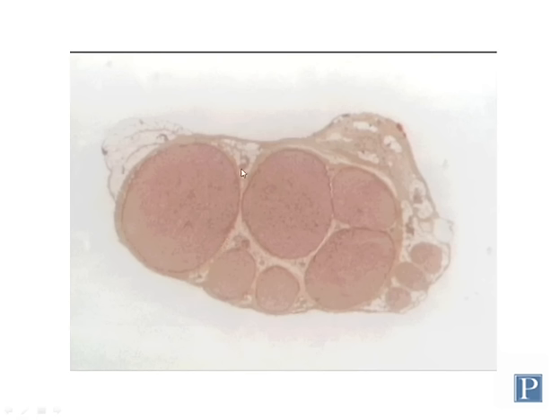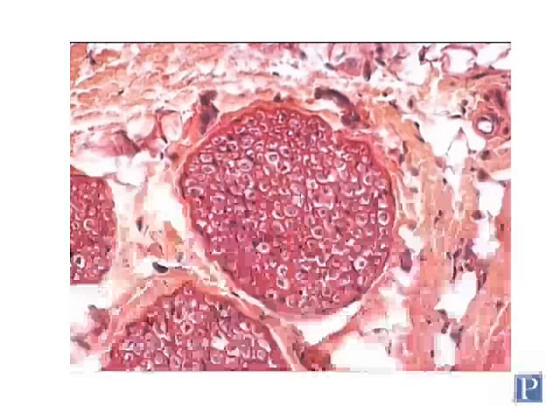Each fascicle is surrounded by another layer of dense irregular connective tissue, which is called perineurium. And so again, if you look at perineurium closely, you should be able to see collagen fibers. There's a third layer of connective tissue, which is called Endoneurium, and Endoneurium surrounds individual axons within a fascicle. But in order to see that connective tissue, you need to use a higher magnification.